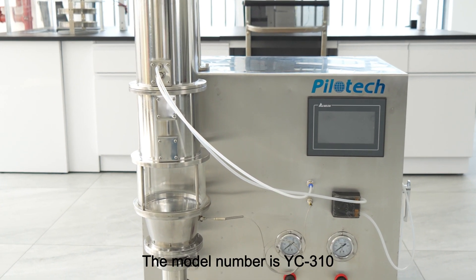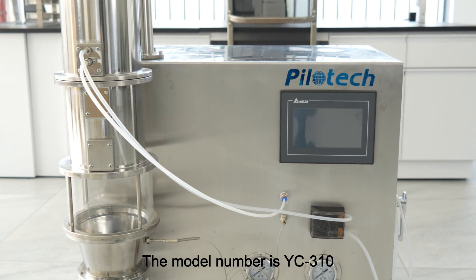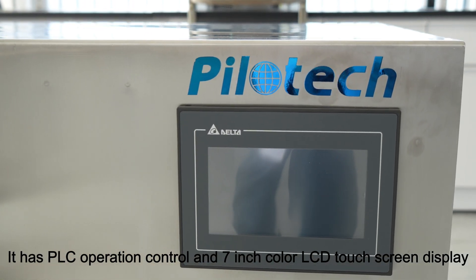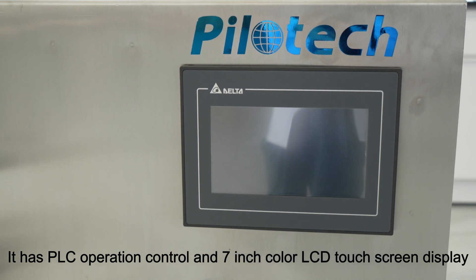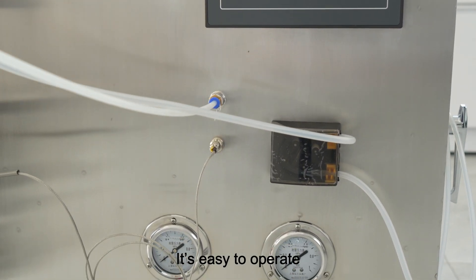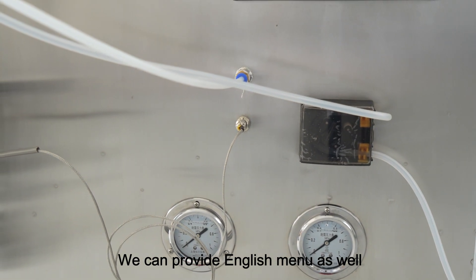The model number is YC310. It has PLC operation control and a 7-inch color LCD touchscreen display. It's easy to operate, and we can provide an English manual as well.